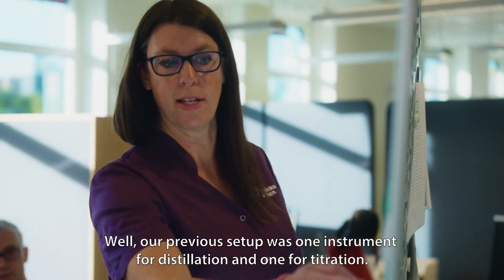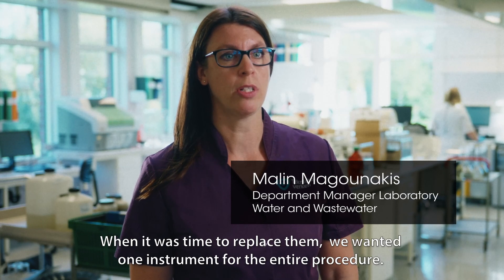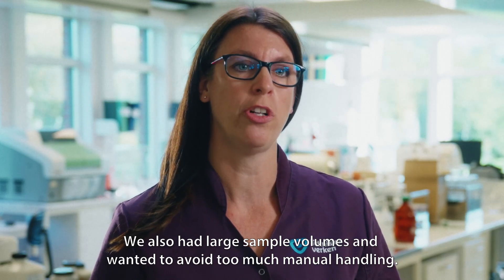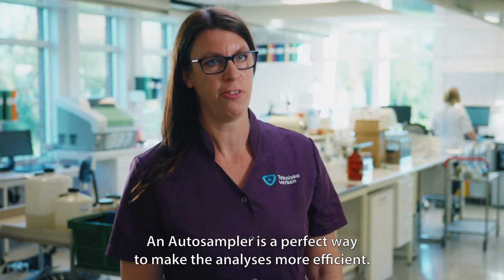Our previous setup was one instrument for distillation and one for titration. When it was time to replace them, we wanted one instrument for the entire procedure. We also had larger sample volumes and wanted to avoid too much manual handling. An Auto Sampler is a perfect way to make the analysis more efficient.